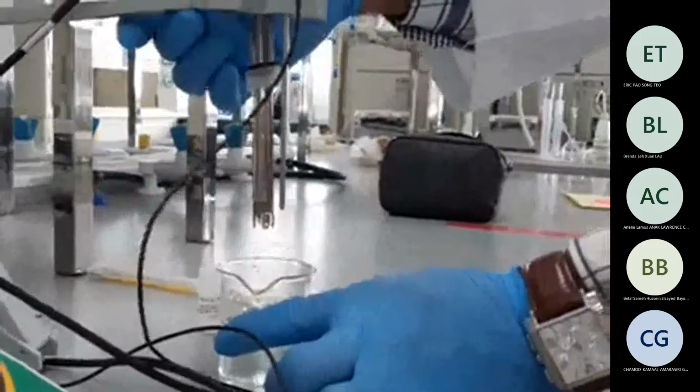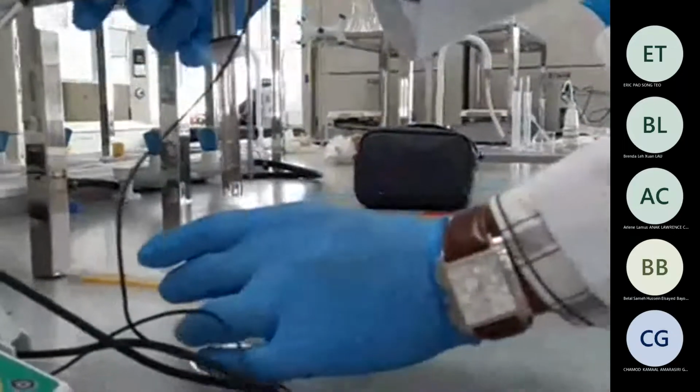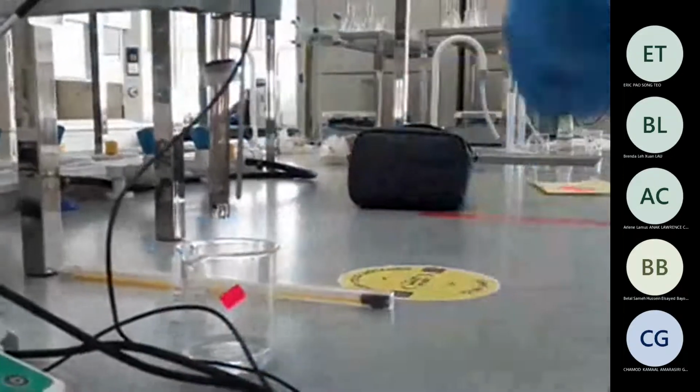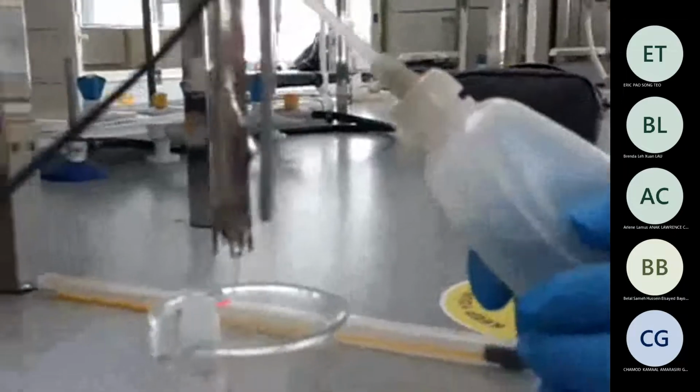All right. Noor, help me to hold the phone, please. Once it is done, we will lift it like that and leave the solution aside. Bring an empty container and wash the probe in this way, just like this. Don't need to force it. Just rinse it gently.